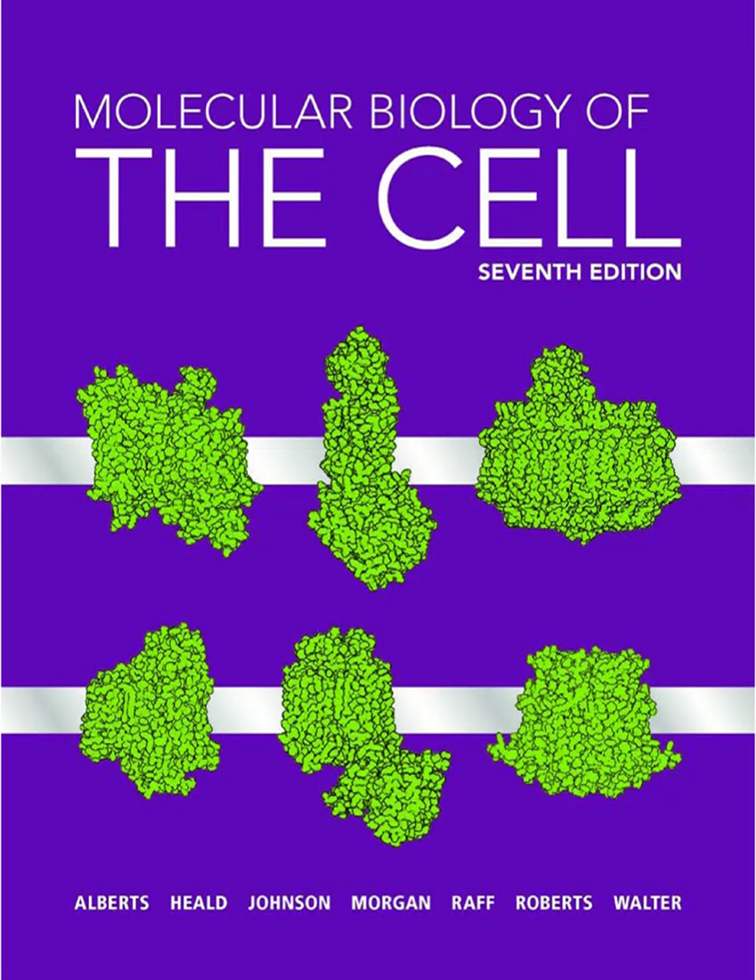So many ways. One simple way is, as a reporter, you link the GFP gene sequence to the control region, the promoter, of a gene you're interested in. So whenever that gene gets turned on, the cell also makes GFP. You get a direct visual readout of gene activity in living cells or organisms. Like a little green light saying this gene is on here. Exactly.